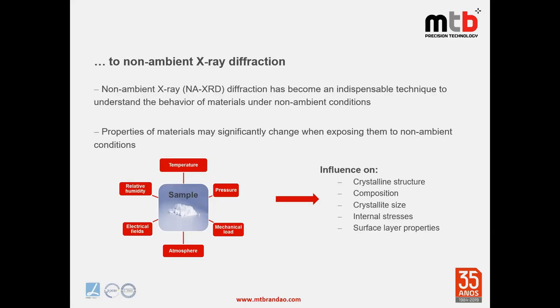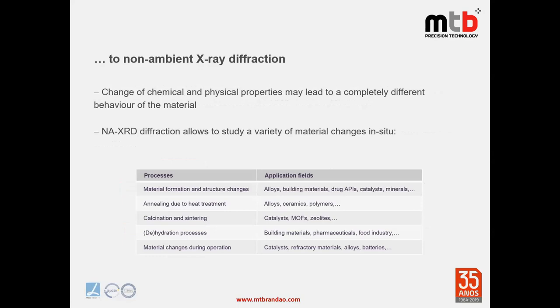The most common changed parameters are temperature, pressure, mechanical load, gas environment or atmosphere, electric fields, relative humidity, and magnetic fields. When exposed to non-ambient conditions, the sample may undergo major changes in crystalline structure composition, and the chemical and physical properties may change significantly, frequently leading to completely different behavior of the materials.